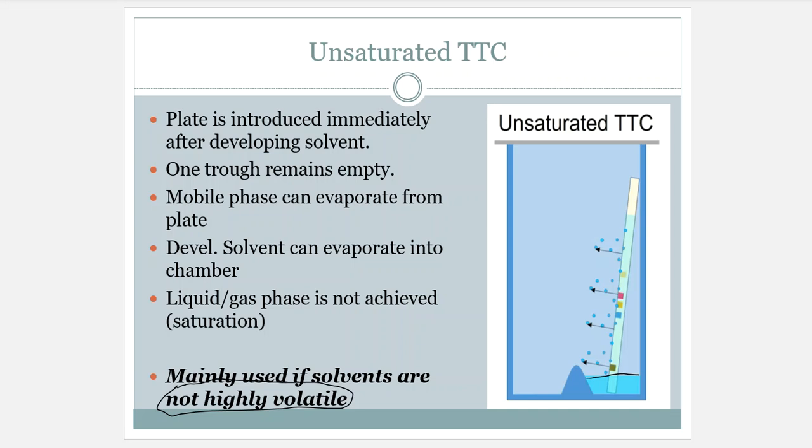That unsaturation will allow us to go ahead and add developing solvent. We know it's not going to evaporate. We know it's not going to go anywhere. We go ahead and dunk the plate into the developing solvent. We put a lid on it, and then when that development gets finished, it is finished. There is no preliminary wait time assigned here.